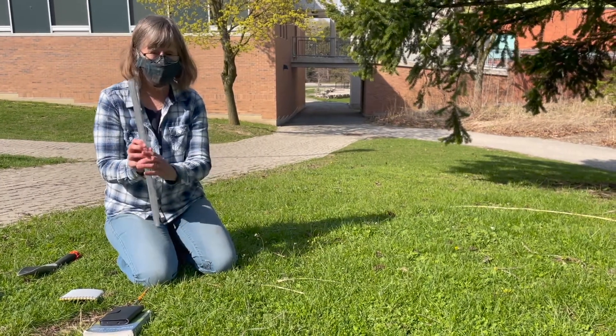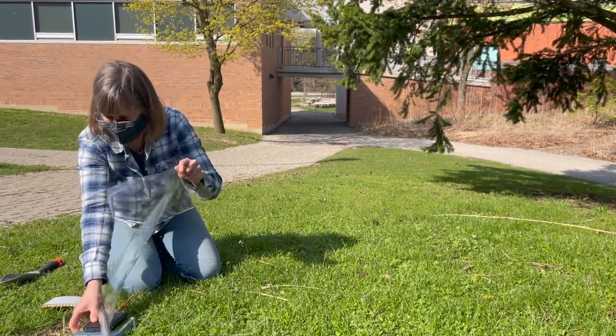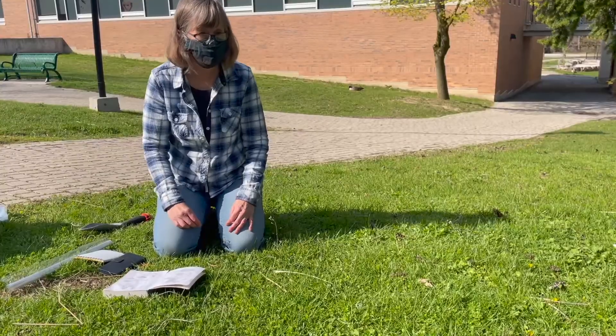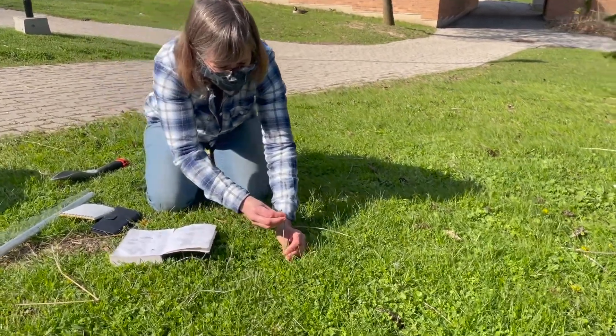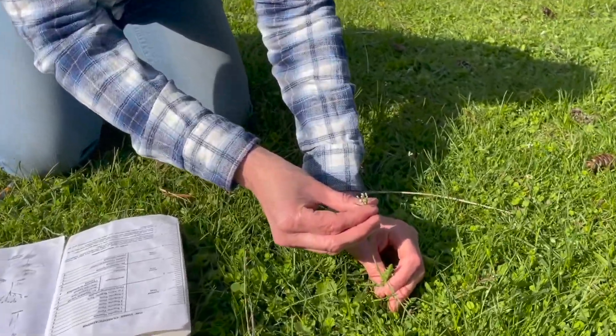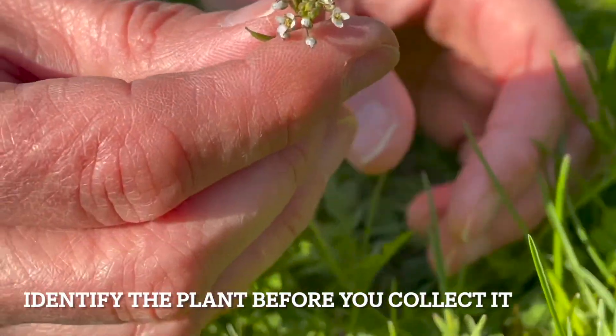A plastic roll is ideal for plant collection. This one is actually a table liner bought from Lens Mill. A plastic bag can also be used, but it is more difficult to keep the plant in good shape in a plastic bag. Ideally, you want to identify the plant in the field prior to collection.